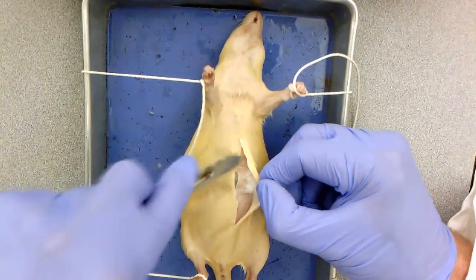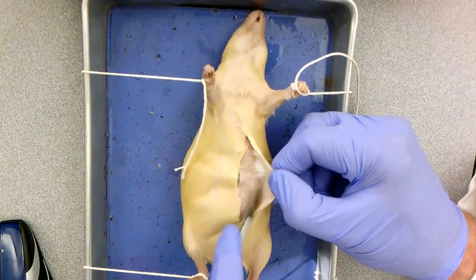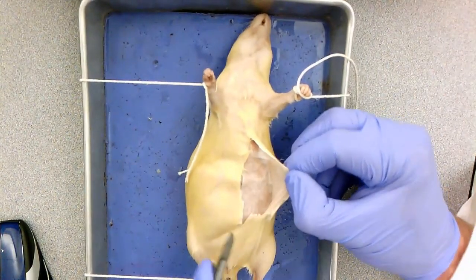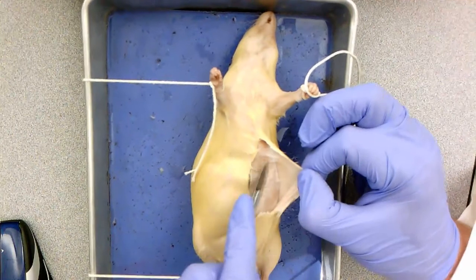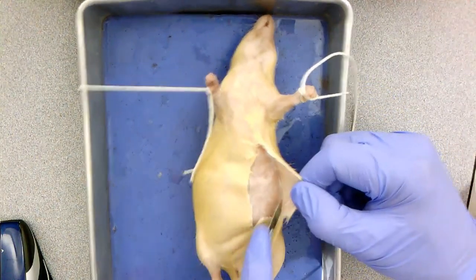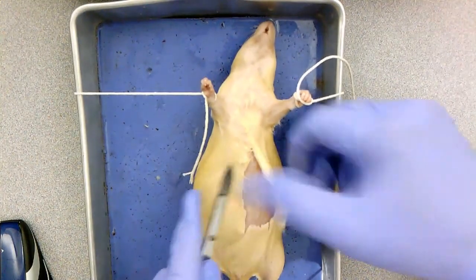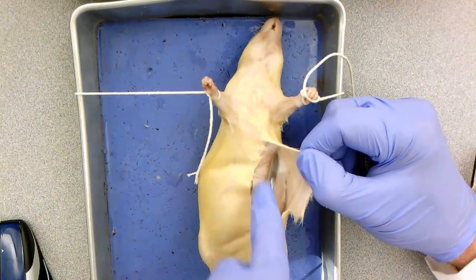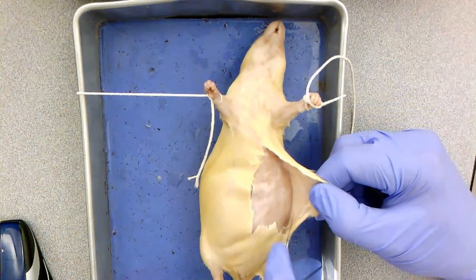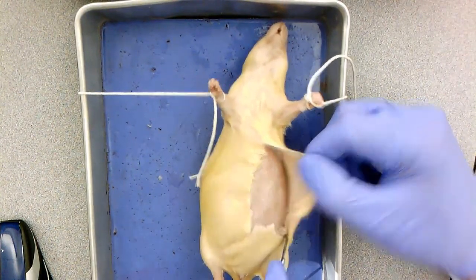So this is the very first step: we're just going to open up the skin on this ventral body cavity right here. If you look real closely, you can see that areolar tissue, that spider web tissue. You know you're doing well with skinning your rat when you see that areolar tissue, and you can just take your scalpel and make a nice, easy incision across that areolar tissue.